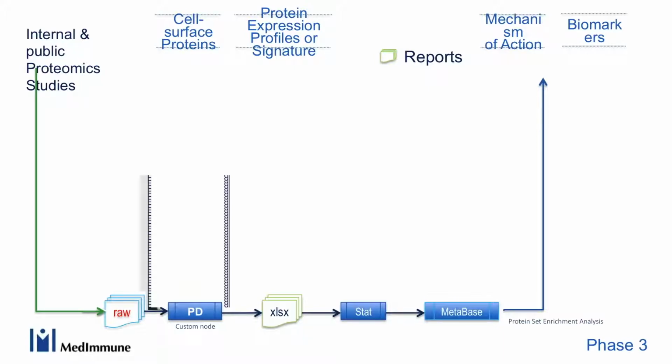The way that we have been looking at the data in the lab is that we have a study, we acquire a bunch of raw files, and we go through vendor-supplied software, and then we have a bunch of Excel spreadsheets, and you flip through that and try to make some sense out of that. LabKey is a system where we try to do a little better to fill in this blank right here.